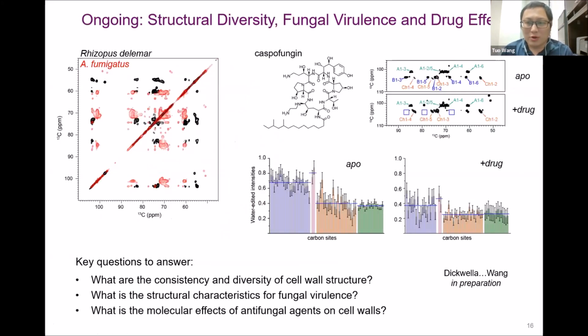So the structural model serves as the basis for us to further investigate the biomedical questions related to structural diversity, fungal virulence, and drug effect. For example, you can see that the different fungal pathogens have distinct NMR fingerprints for the cell wall.